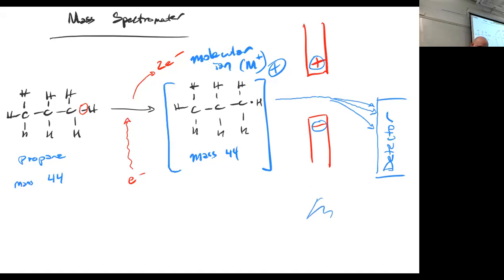There we go. It's going to give you the mass divided by the charge. Those are divided because a larger mass would result in being farther to the right on this detector, if you were to look at it sideways, and a larger charge would result in it being further to the left. So they're inversely proportional. A large charge makes the path bend more, a large mass makes the path bend less. But because our charge is always going to be +1, we don't really need to worry about the Z part of this. It's just going to be the mass. That's practically what we see.